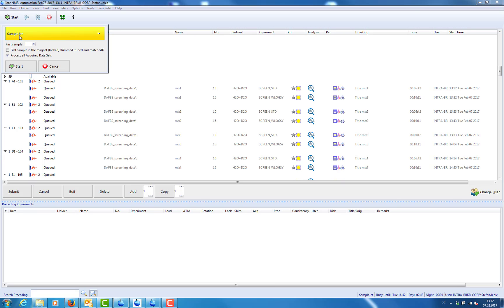Now we can start our run by clicking on start and entering the correct holder position to start with.